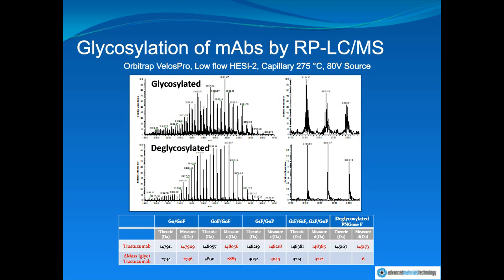And the way we do that, and it's shown in the next slide, this is the raw mass spectral data across those chromatographic peaks, comparing the glycosylated and deglycosylated IgG. And you can see in the top set of panels, whether blown up or deconvoluted data, that you've released the glycans. You can calculate by comparing these two what the level of occupancy was for that chromatographically resolved material in terms of its oligosaccharide composition.